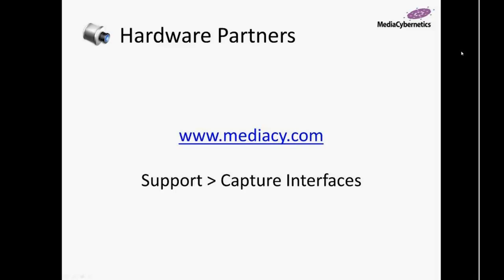One thing about Media Cybernetics is we want to make sure we provide you with excellent support, and we're always providing you with all the necessary resources to get the job done. All of these capture drivers are free of charge. We won't charge you anything extra for as many cameras as you need to support.